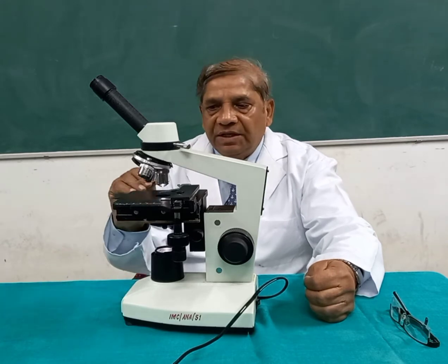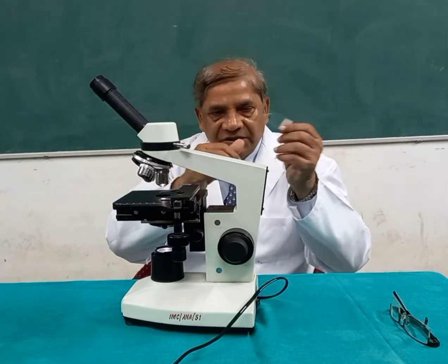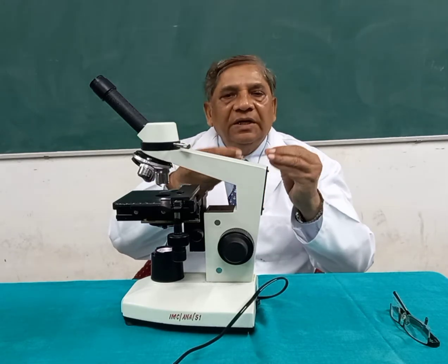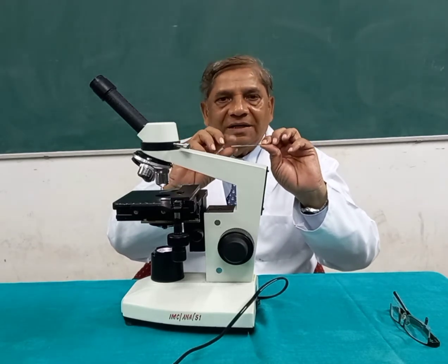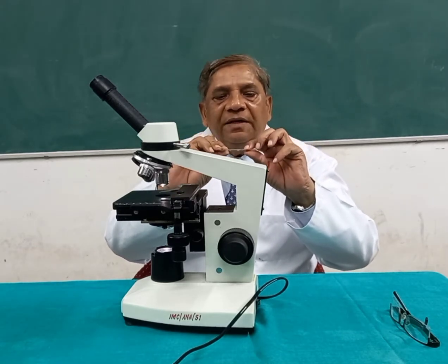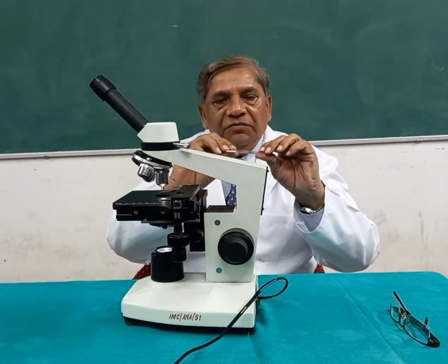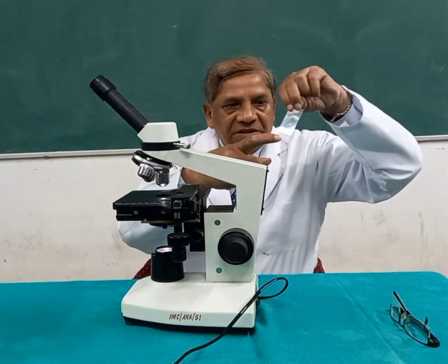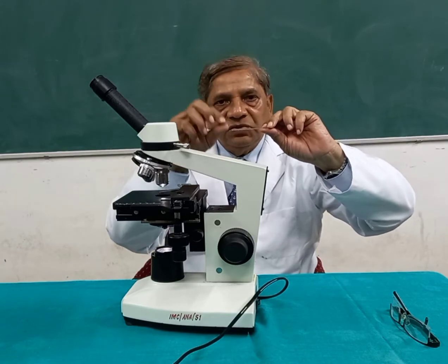Then the second step is that you take this slide in your hand and clean the slide with the help of tissue paper or the cotton provided to you. The important step in putting the slide is that you should put the slide where the cover slip faces upward. How will you find out that the cover slip is facing upward? Just see, this kind of label will be there. This label should face upward.